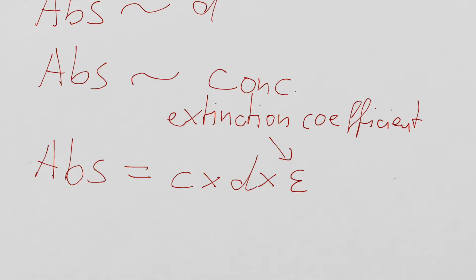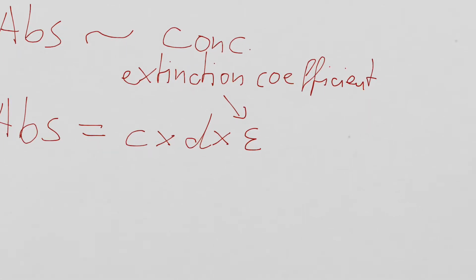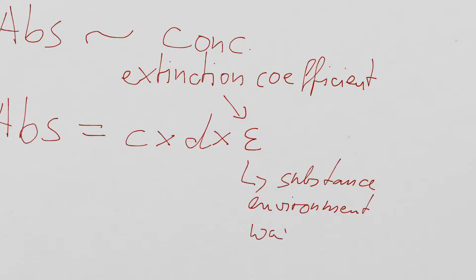So extinction coefficient depends on substance, environment of substance, and the wavelength. Okay?